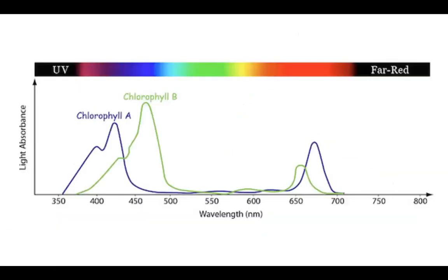So for chlorophyll, we have two kinds of chlorophyll at the molecular level. I didn't explain it before because we don't have to go into that detail. Chlorophyll A and chlorophyll B are just different configurations of the same molecule, and they absorb light at slightly different wavelengths. As you can see, somewhere around 450 you have a peak of chlorophyll, and around 420 and about 470 you have two different peaks of chlorophyll. So this kind of spectrograph is what we are planning to develop as we get the spectrum from you. And we are also experimenting with our devices here.